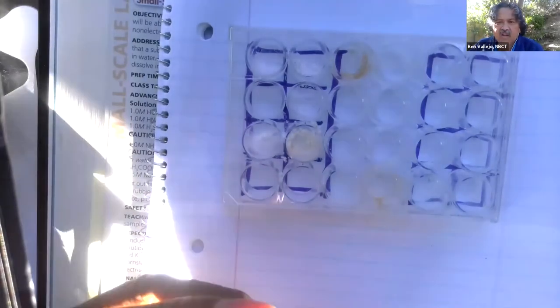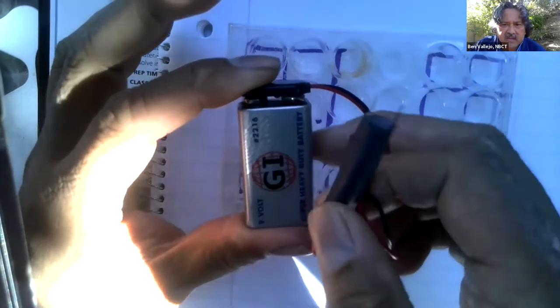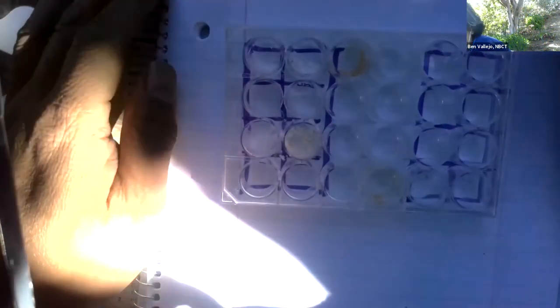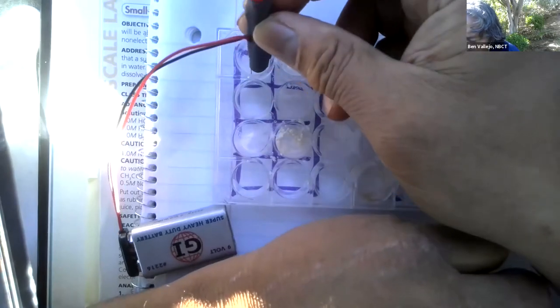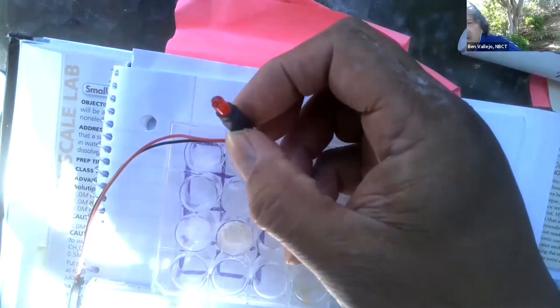Let's see. So I've got my conductivity tester going. Is the recording on? It is. And I'm going to move myself so I can get a shadow. Sorry, dog. And let's see what we get for the first one with salt. Let's go. Did you see it? Oh, you can't even see the light. Okay. So there's the light.